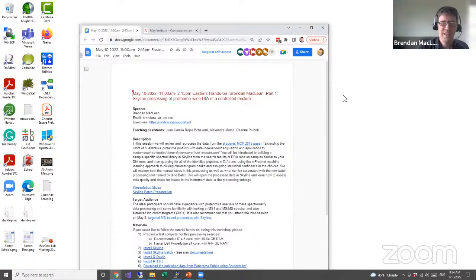We've definitely shown this with SRM, where there's very low interference. We show that using 5 transitions gives you more reproducible quantification than using the best transition. So in the absence of interference, you have to think about the likelihood that you have interference. In DDA, when you're using MS1, the likelihood of interference is one of the highest of all the different ways of using a mass spectrometer to measure peptides.